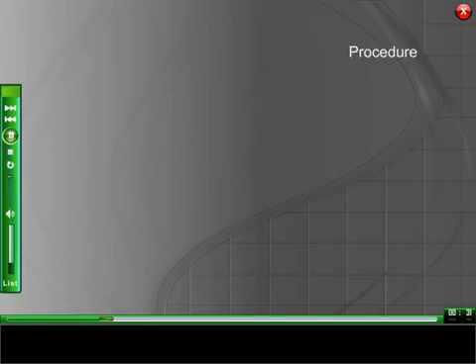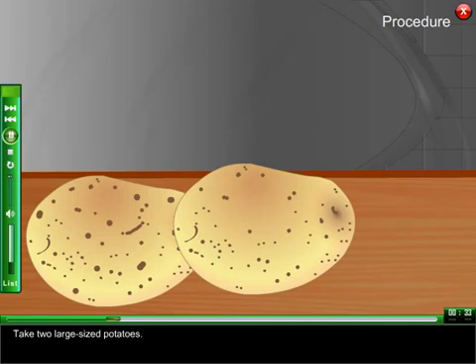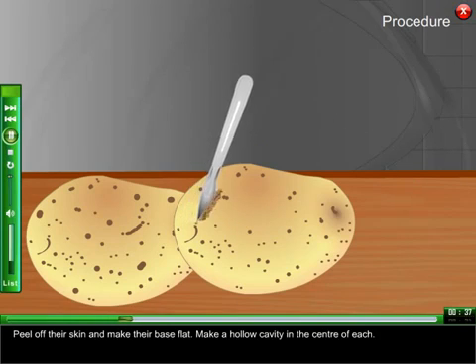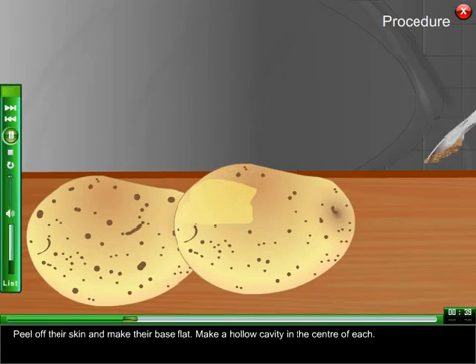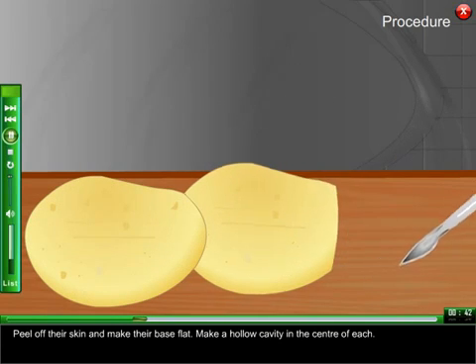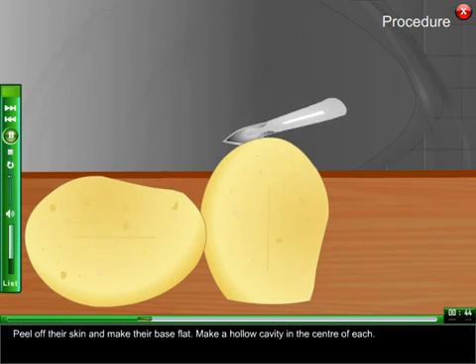Procedure. Take two large sized potatoes. Peel off their skin and make their base flat. Make a hollow cavity in the center of each.